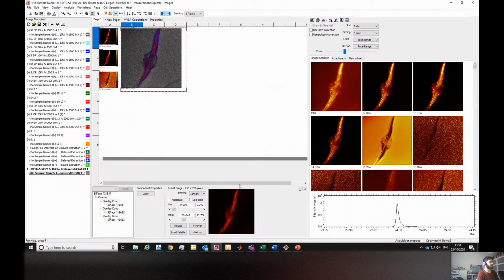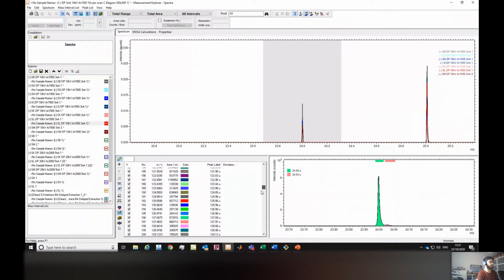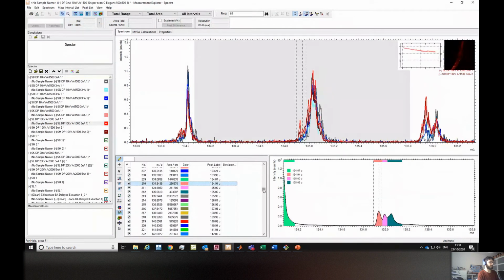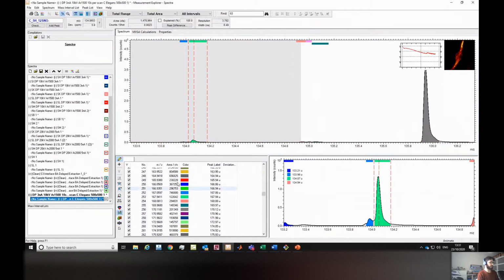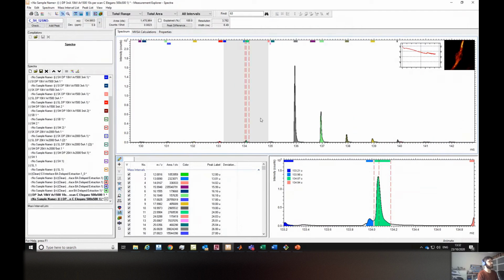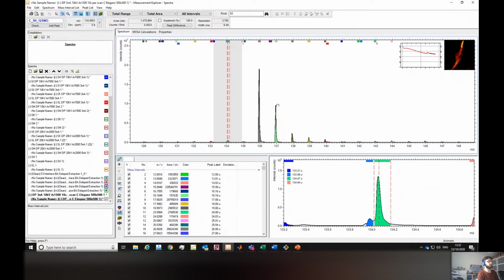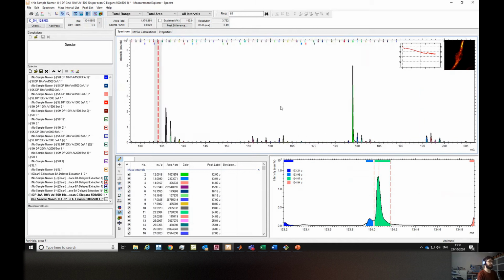Before we do this, obviously you need to have your pick list applied to the data, right? So now, again, all those steps of creating the pick list. And here you don't have to use the overlay thing because you can just use the total spectrum of your entire 3D data set to create the pick list.